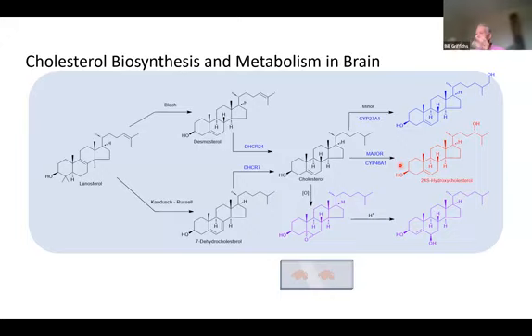That means cholesterol can be oxidized by the oxygen in the air. So when you have cholesterol and air, you get an epoxide formed, which is cholesterol 5-6 epoxide. And the cholesterol 5-6 epoxide, actually in the derivatization, will isomerize to 6-beta hydroxycholesterol.